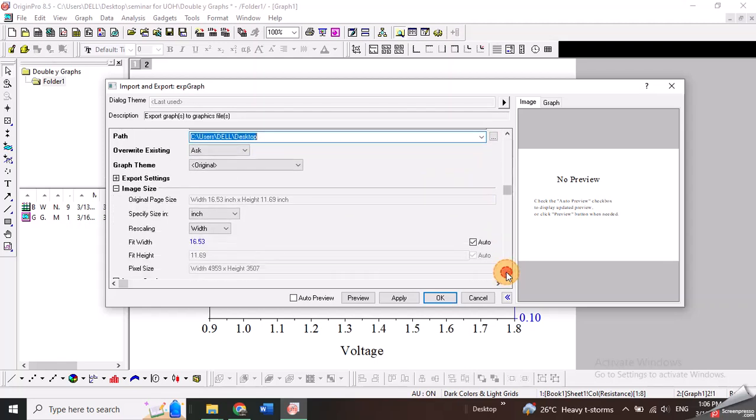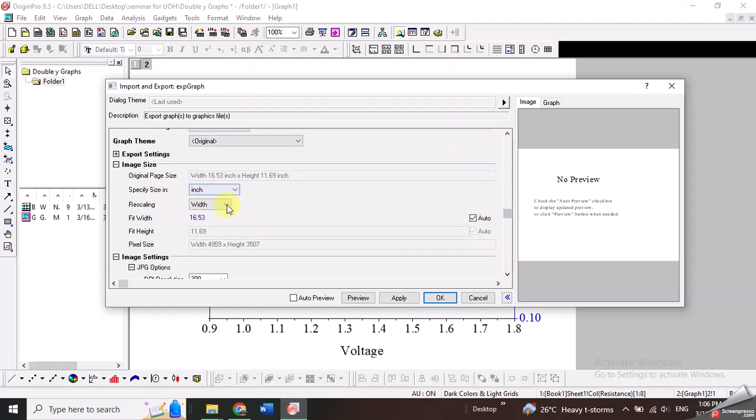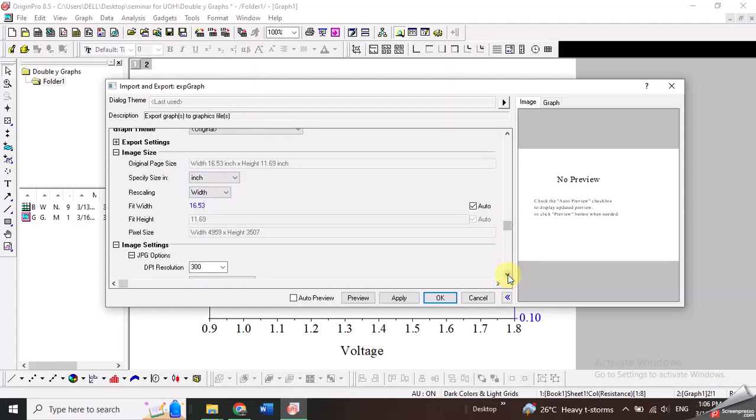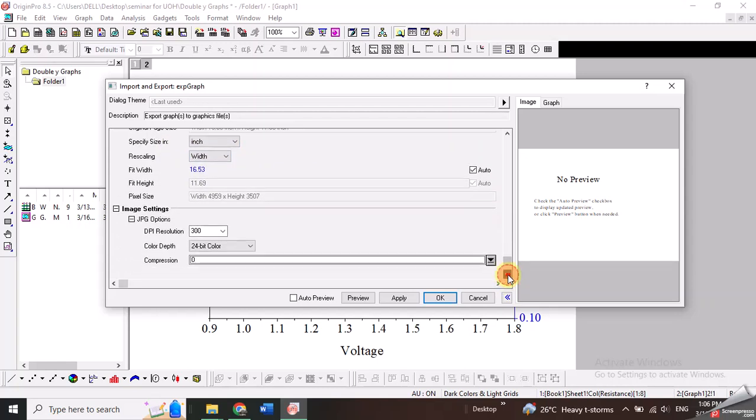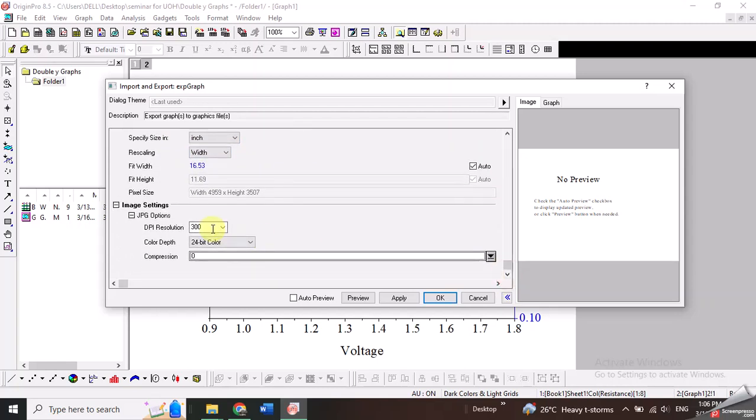There are certain other options. You can change the width of your image as well. I will not change this option. Then here you can also see the DPI resolution 300. 300 is selected. I will not change it.